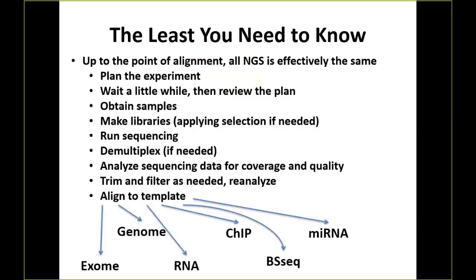So what is the least you need to know here? Really, the least you need to know for designing an NGS experiment. First step, plan the experiment. Obviously, plan it carefully. If NGS isn't something you're experienced with, find somebody who is and see if they'll help you plan it out.